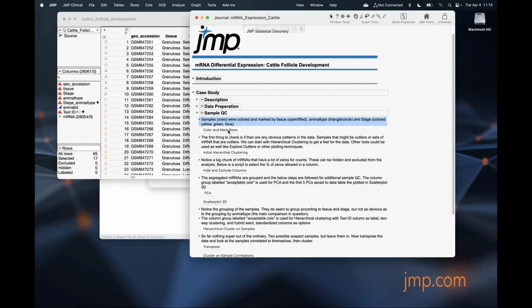If you want to know more, there's something called an action recorder or an enhanced log. Feel free to reach out to Ross and Kevin on how to do that. That's all I did. I just captured those steps, and then I created a little button here. It's a little script that gets run.